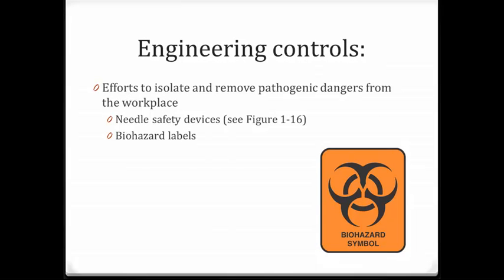There are also engineering controls — efforts to isolate or remove pathogenic dangers from the workplace. We often have needle safety devices and biohazard labels on potentially infectious materials, and this is an example of a biohazard label.